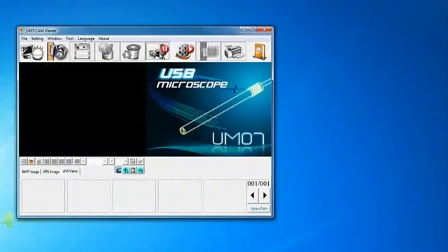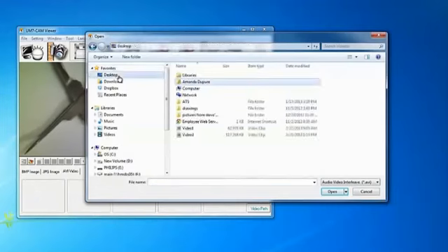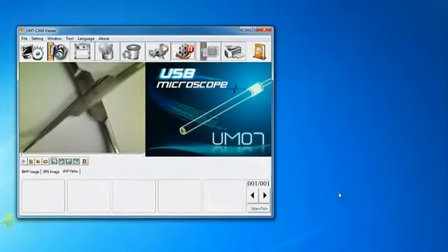To stop recording, click on the Video Recording button again. You will then be able to watch the video by clicking on the icon to your right or by opening the video on your computer in the selected folder.